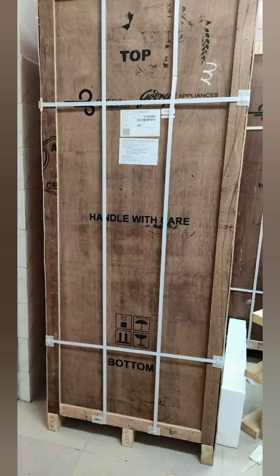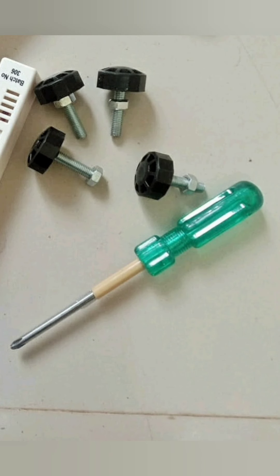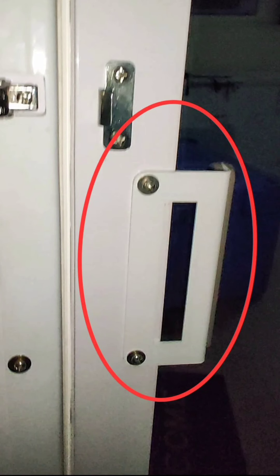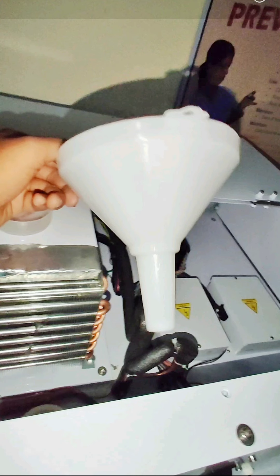In the packing, there are accessories in the refrigerator. We can see the accessories in the back. There is a screwdriver. There is a thermometer. This thermometer can be transported to the ice box. It is optional. There is no link to the refrigerator. There is a door handle. There is a funnel.